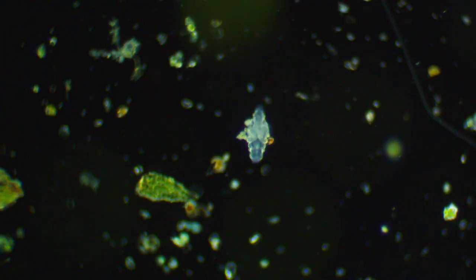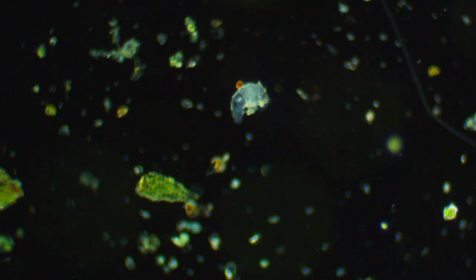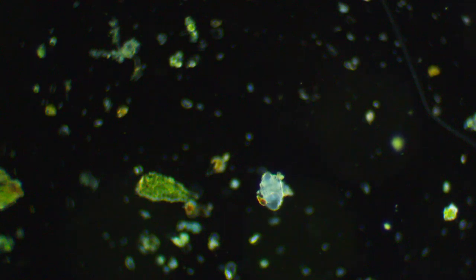Microscopic underpants. Okay. A cover slip is the underpants, I guess. Okay. It's like clear plastic underpants.